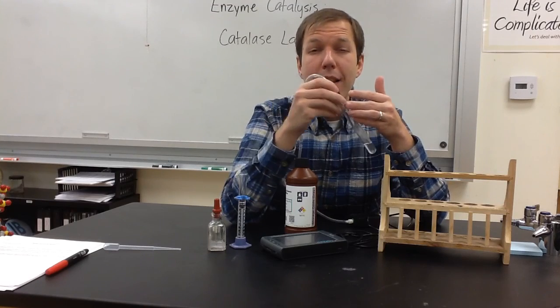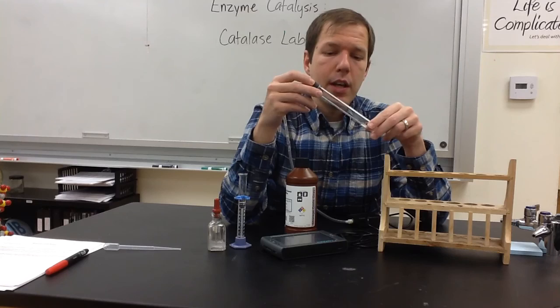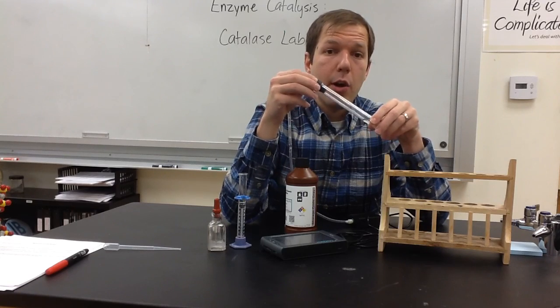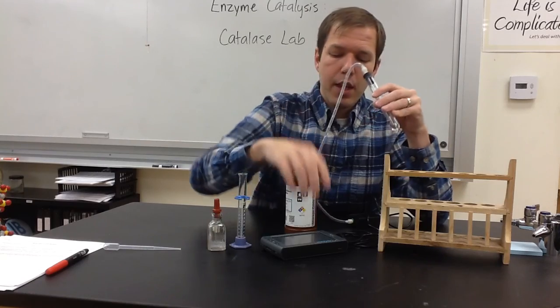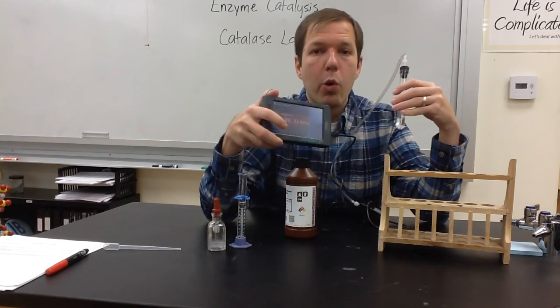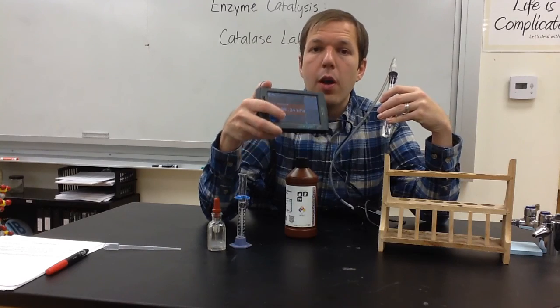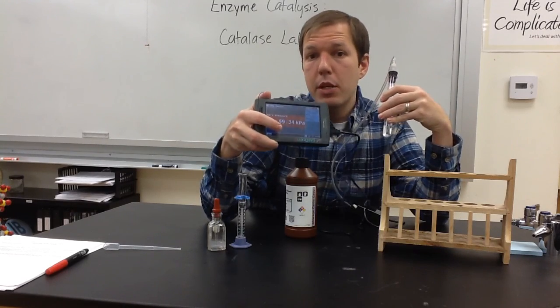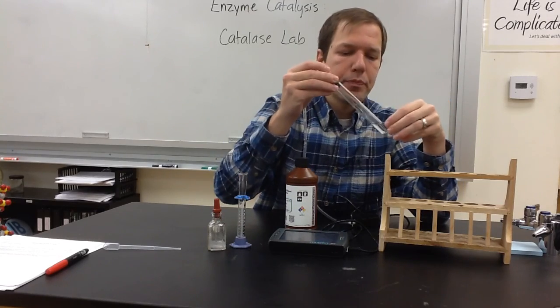So as the number of molecules of gas increase here, that's going to cause an increase in pressure. So increases in pressure are going to give me a measurement of how much reaction has occurred. Now, because the LabQuest can record data over time, the increase in pressure over time can be used to determine the rate. I'll come back to that at the very end of the video.